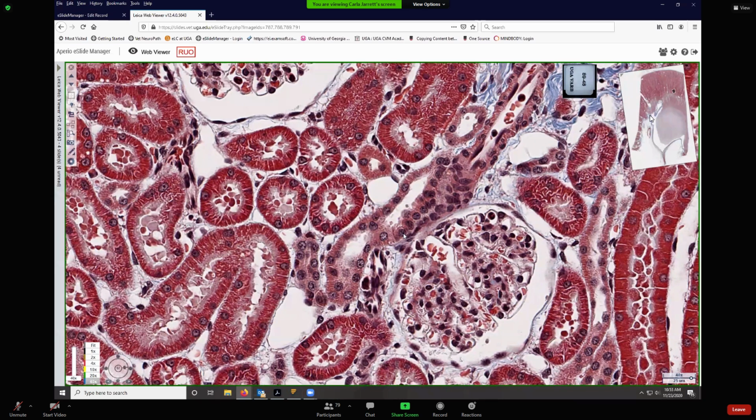and you'll identify it because the nuclei are all really close to each other and they're pressed up against the extraglomerular mesangial cells right here. And you can see this afferent arteriole is about to run through the core of all that. So those JG cells in that wall of that afferent arteriole, they'll be in close opposition to these other two components.